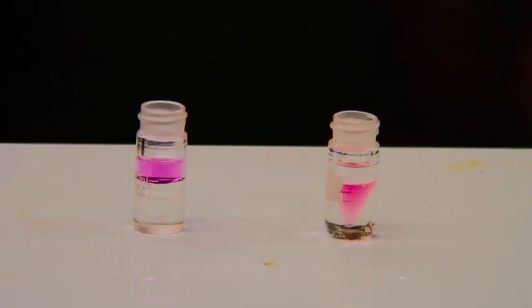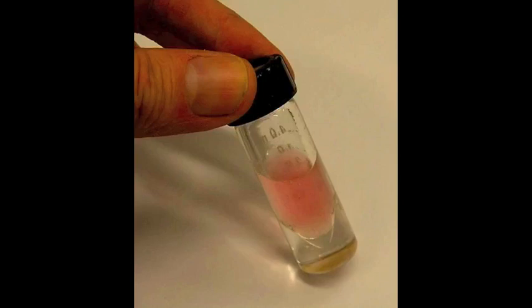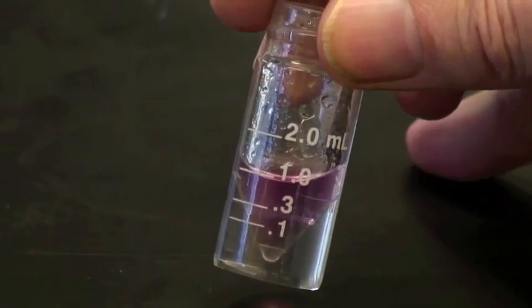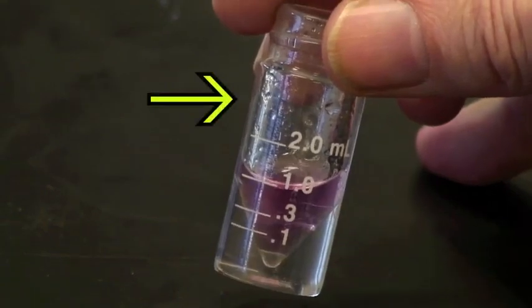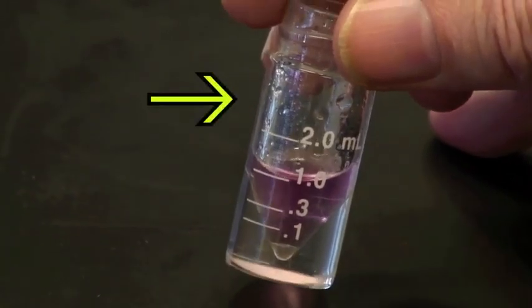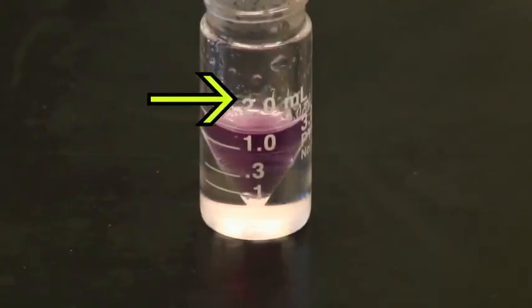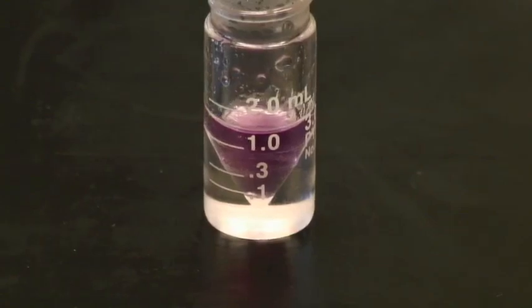Once you have washed an organic phase a few times with water, or an aqueous phase, you'll have removed most of the polar water-soluble impurities. However, there'll probably be water itself left in the organic phase as an impurity. Usually this shows up with the organic phase being cloudy. Sometimes you'll even be able to see little droplets of water present. You'll have to get rid of the water. You do that by drying. Not with a towel, not with heat, but usually with some anhydrous salt, sodium sulfate, or calcium chloride, typically.